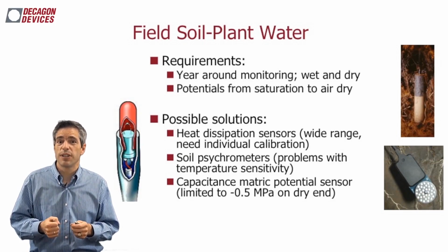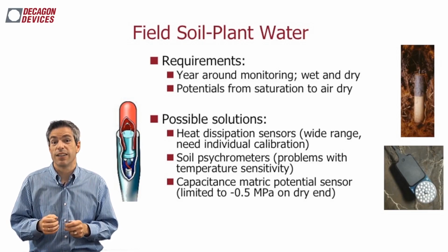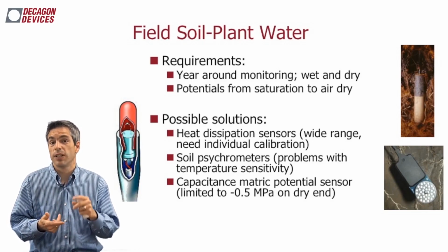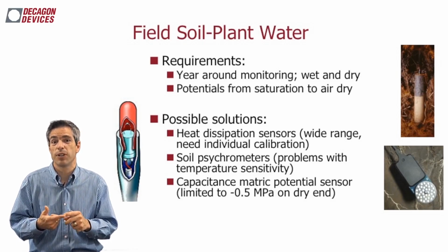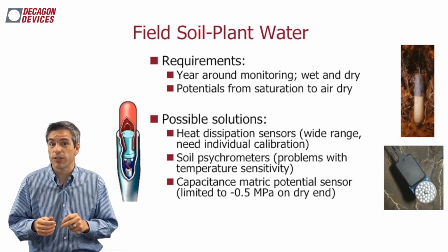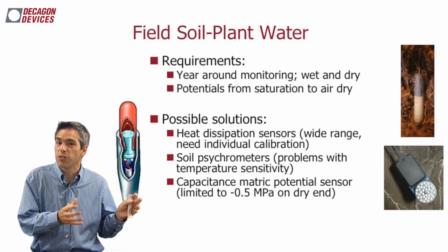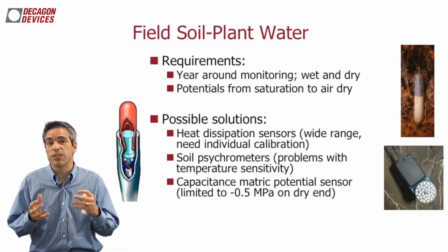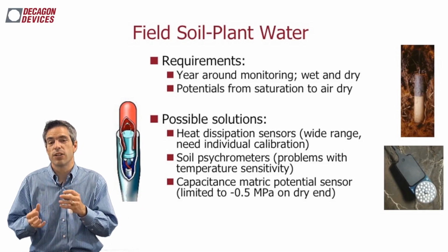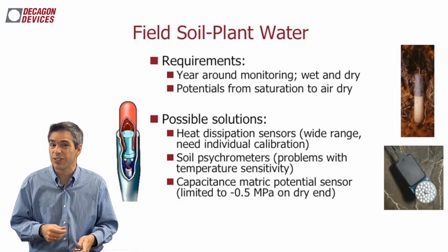A lot of people also use tensiometers, but the big concern is they are a maintenance headache. However, there are tensiometers out there that have been developed that can go to very high or low, more negative, water potentials. So you can go out there and look for those. They're not very common and really more in research university labs. And there are tensiometers out there that will self-fill. So when they go dry, they'll wait till the water is back in the soil, they'll sense that and fill themselves back up. So that is an option.